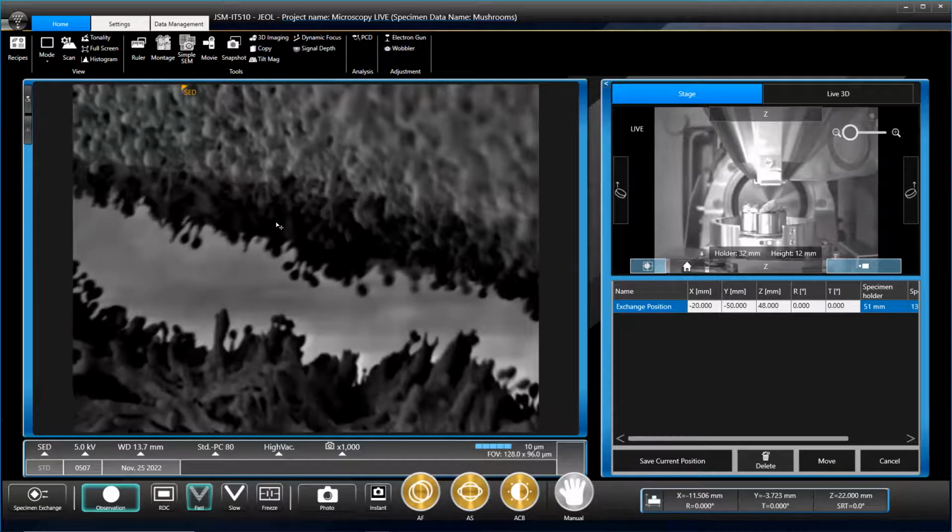I guess it's going to be hard to focus because they're all at different depths, aren't they? Yeah, definitely. It's not even perfect, but you do get quite a nice little silhouette. Oh, at the bottom. That's nice. Little cartoon slug.